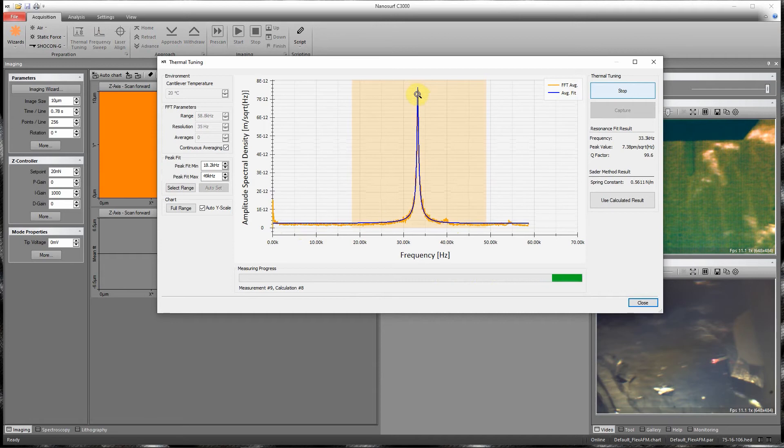Using the frequency, the peak frequency, and the Q factor, which is calculated here, we can then calculate the spring constant of the cantilever using the Sader method.